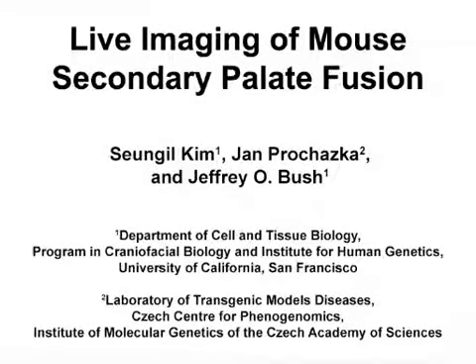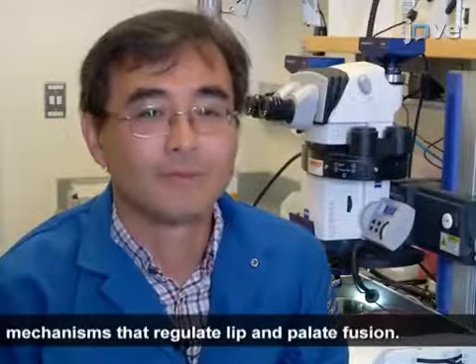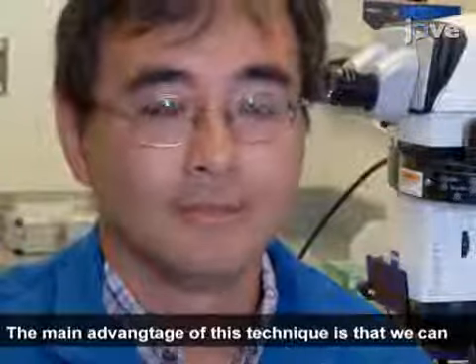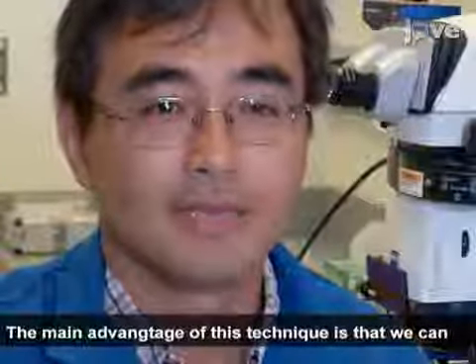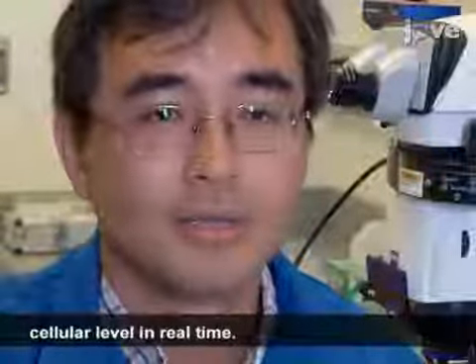The overall goal of this confocal live imaging method is to directly observe the cellular processes that drive secondary palate fusion during craniofacial development. This method can help answer key questions in the craniofacial biology field, such as what are the cellular mechanisms that regulate lip and palate fusion. The main advantage of this technique is that we can directly observe the cellular process of tissue fusion at the cellular level in real time.